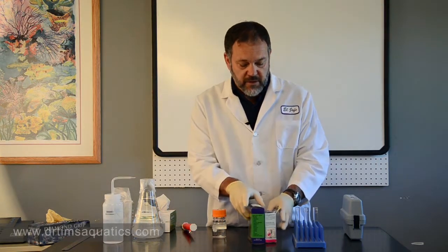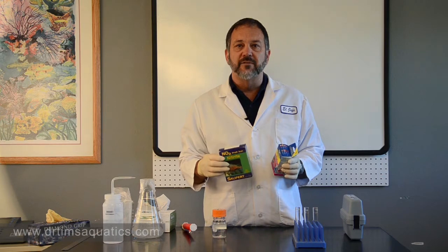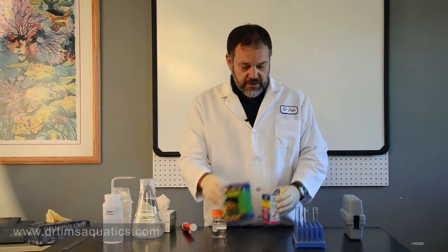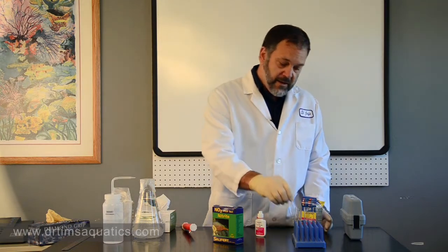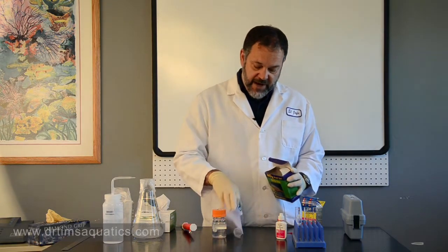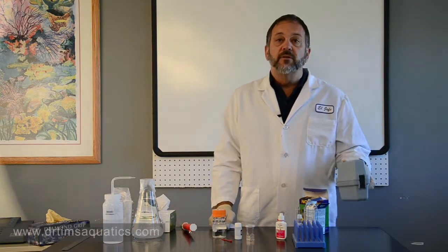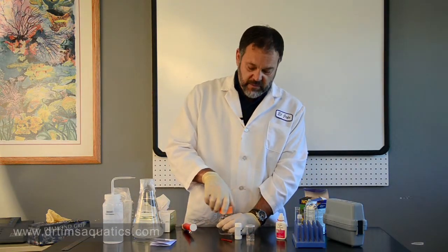For this example, I'm going to use two common test kits: one from Aquarium Farm for nitrite, and also the nitrite test kit from Salifert. But what I'm going to talk about applies to ammonia test kits, nitrite test kits, all the different versions from all the different manufacturers. The Aquarium Farm kit uses drops — you fill up the vial to the line and add so many drops. The Salifert test kit uses powder — you have a vial, some powder, and a little scoop. As a comparison, I'm also going to use a Hach test kit, which is a little higher standard and better quality than what's available to the hobbyist.